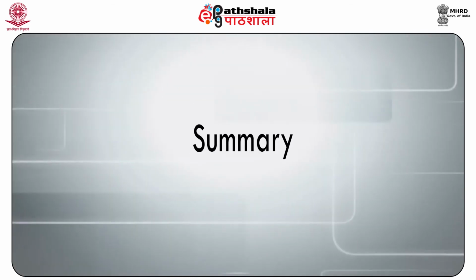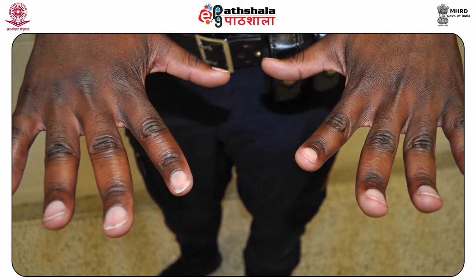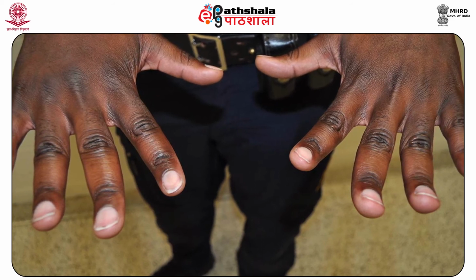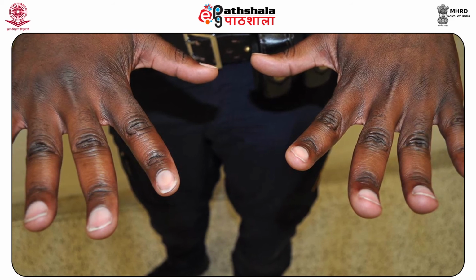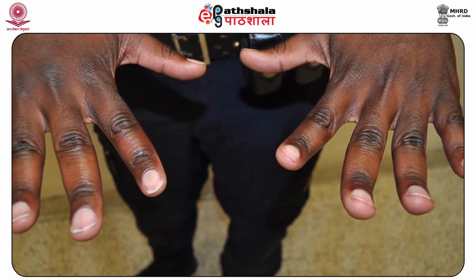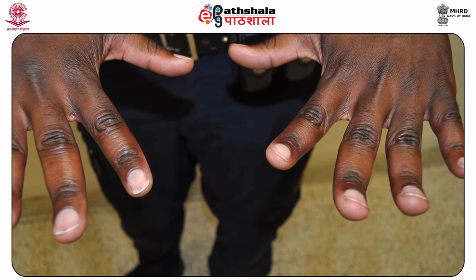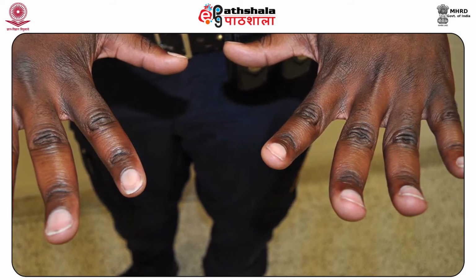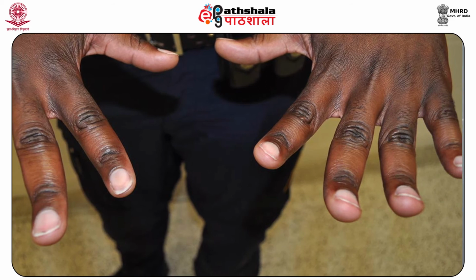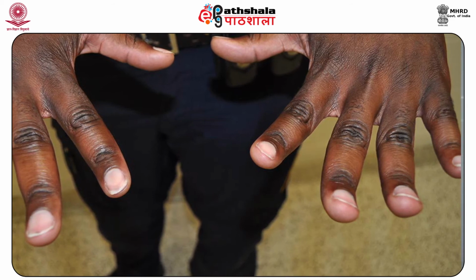Dear students, now let me summarize this chapter for you. In this chapter, I have told you about GSR, and we have come to know that GSR is produced due to burning of powder, rubbing of the bullet with barrel parts, and explosion of priming compounds. Along with it, I have also discussed that GSR particles may be found on the target, and when the target is a human being, they may exist on the body of the victim and on his clothes, depending on the range of firing and other factors.